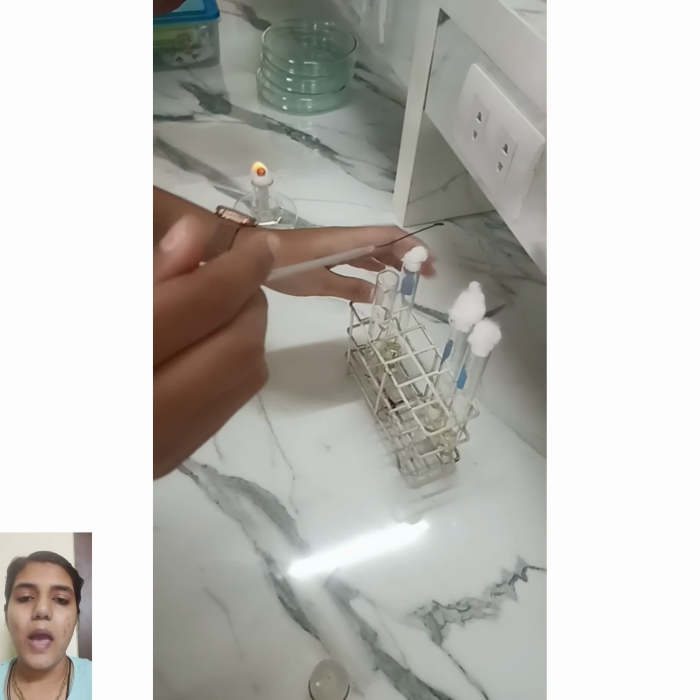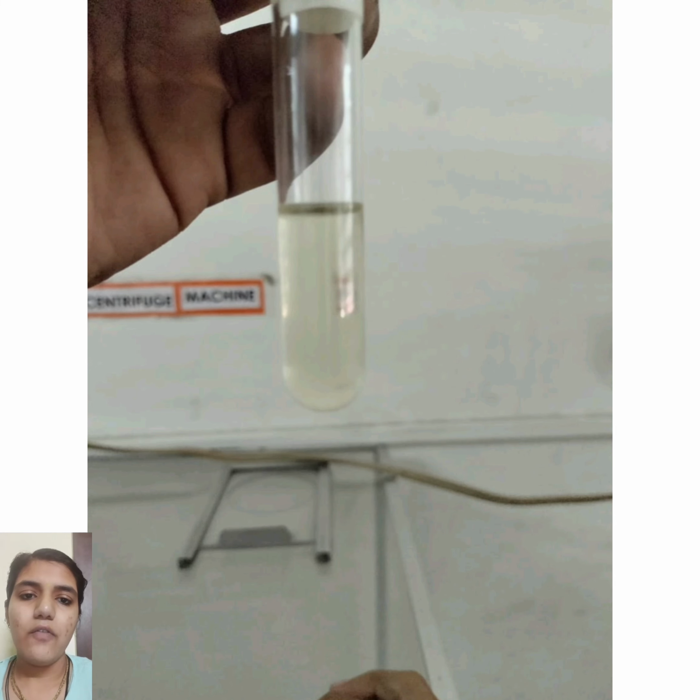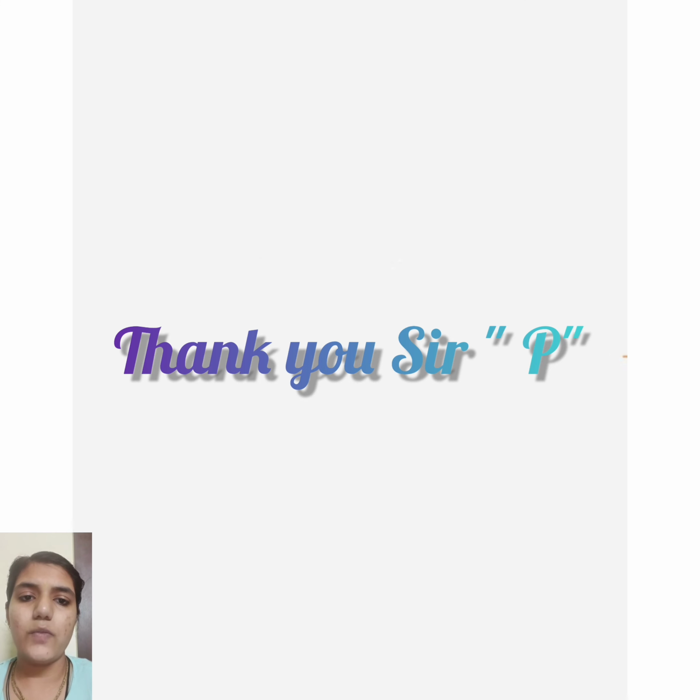We need to perform the same activity three times, once per test tube that contains nutrient broth, and this technique is called aseptic technique, which we follow to prevent contamination while performing any experiment in the laboratory.